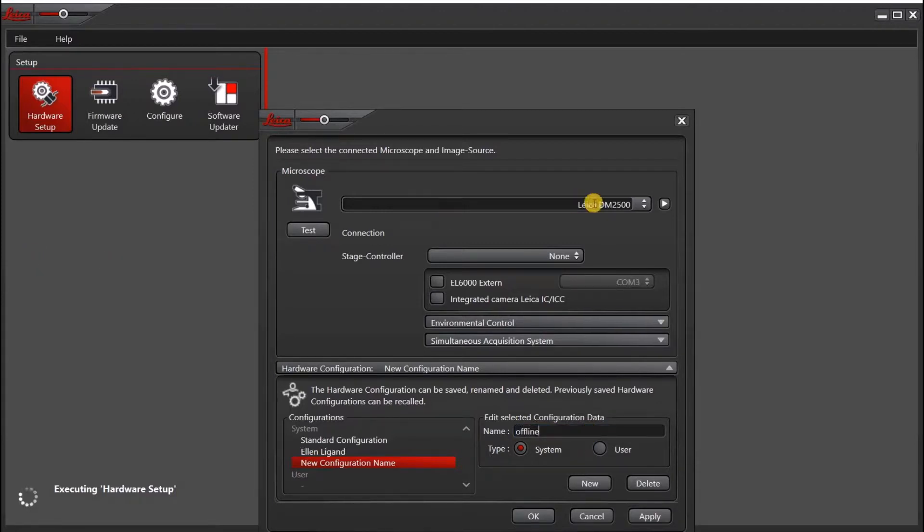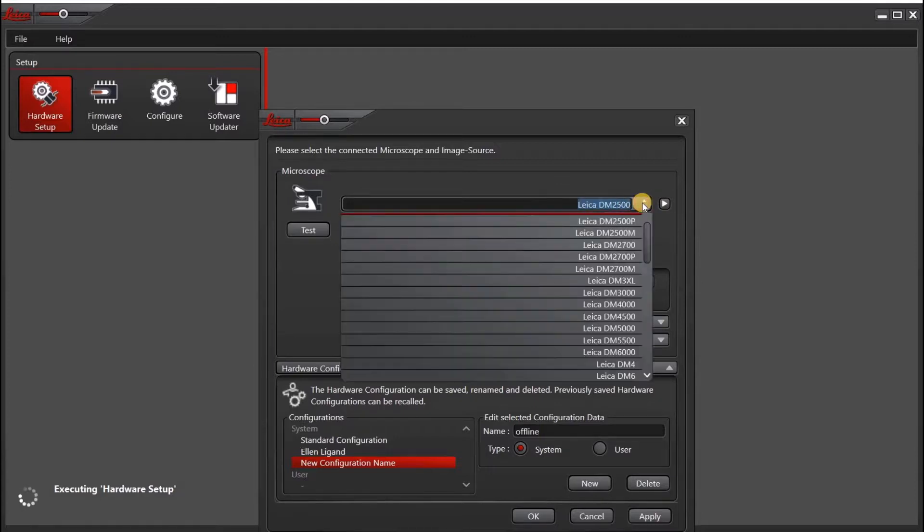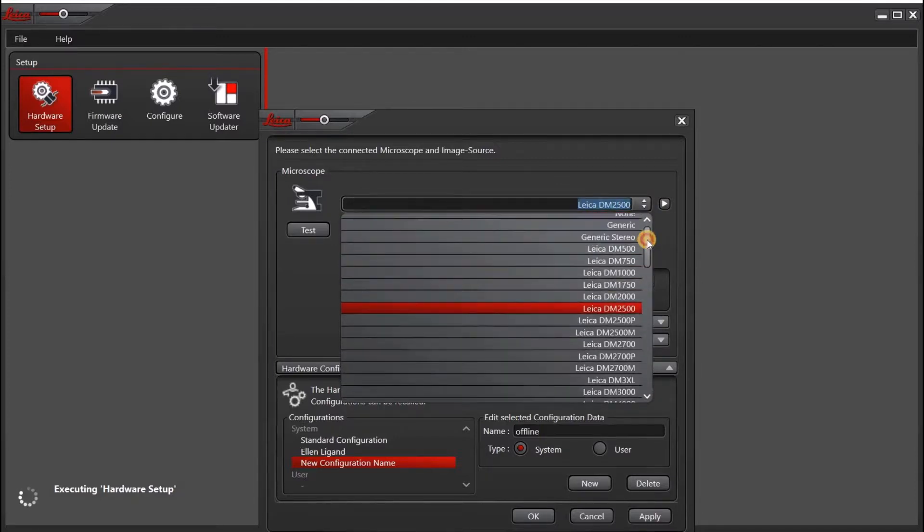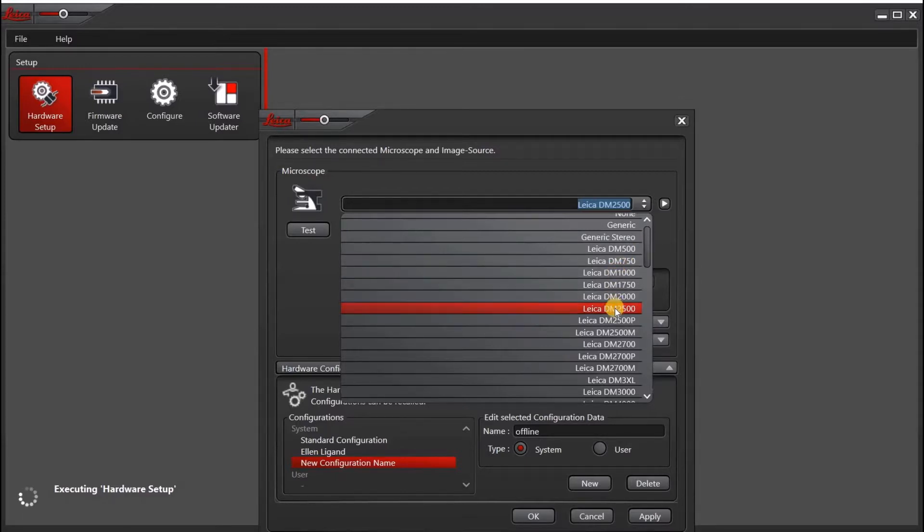Next, go up to the microscope icon, and under this menu, you want to select one of the following microscopes: DM-1000, DM-2000, or DM-2500.